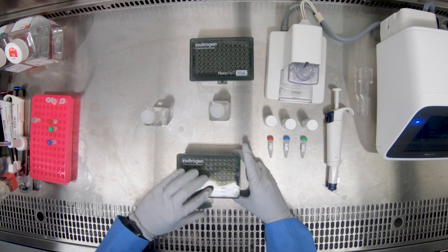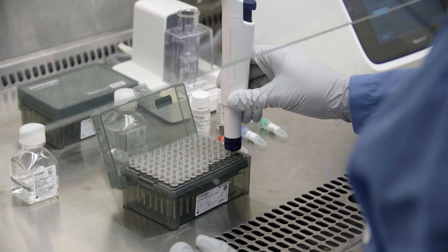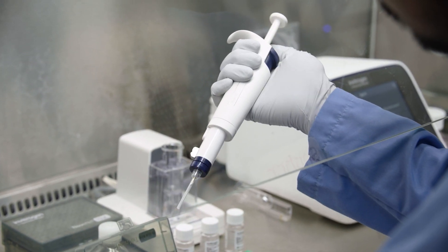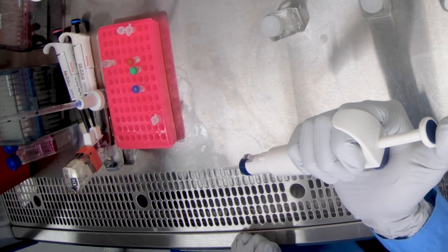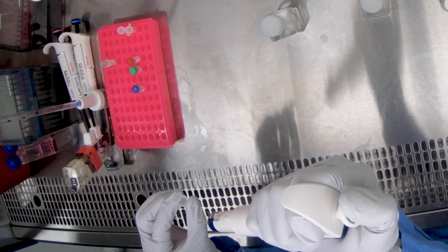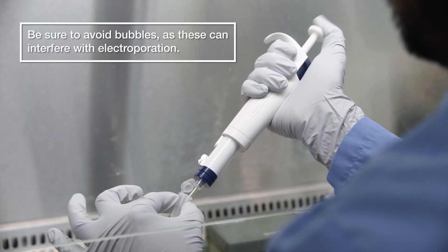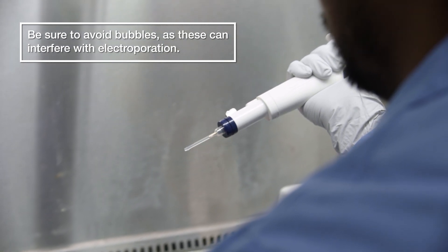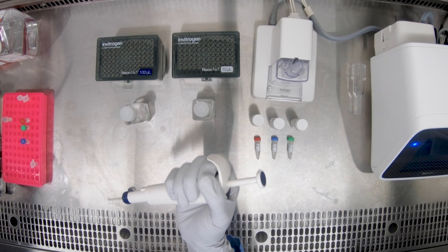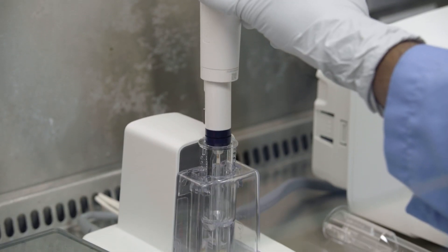Now attach the appropriate size NeonNext Pipette Tip to the NeonNext Pipette. Make sure the metal plunger retracts all the way. Next, resuspend the cells and slowly load the mixture of harvested cells and payload into the NeonNext Pipette Tip. Be sure to avoid bubbles, as these can interfere with electroporation. Place the pipette tip into the buffer tube in the docking station. There should be an audible click that lets you know your pipette is securely in the hub.